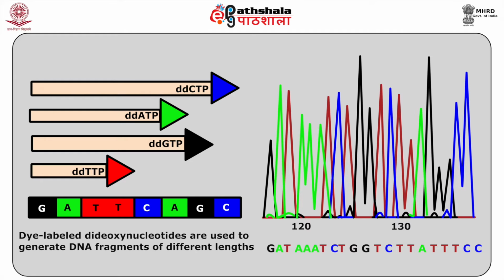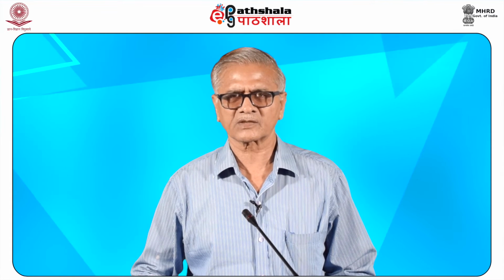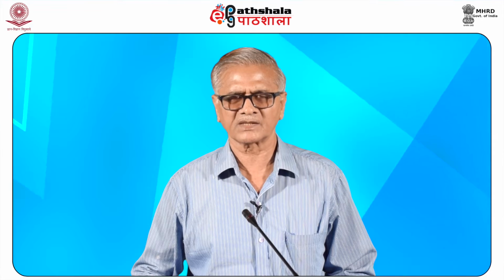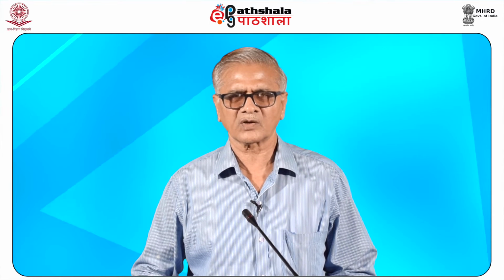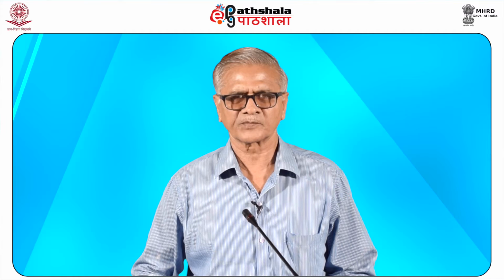Fluorescent labeled dideoxynucleotides generate DNA fragments that terminate at each nucleotide along the template strand. The DNA is separated by capillary electrophoresis on the basis of size. From the order of fragments formed, the DNA sequence can be read.